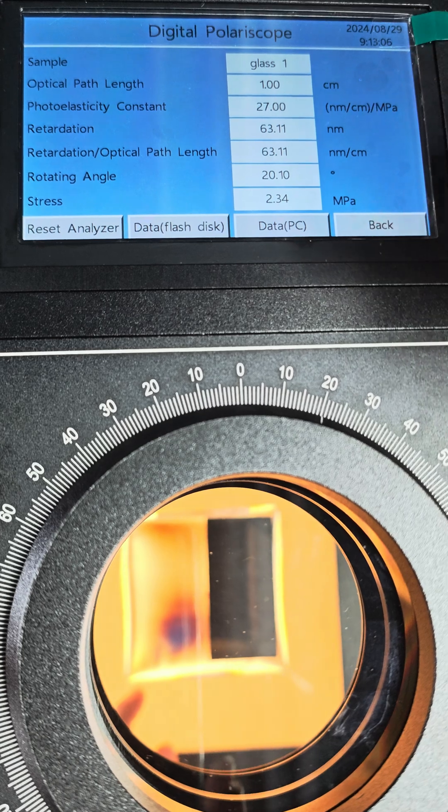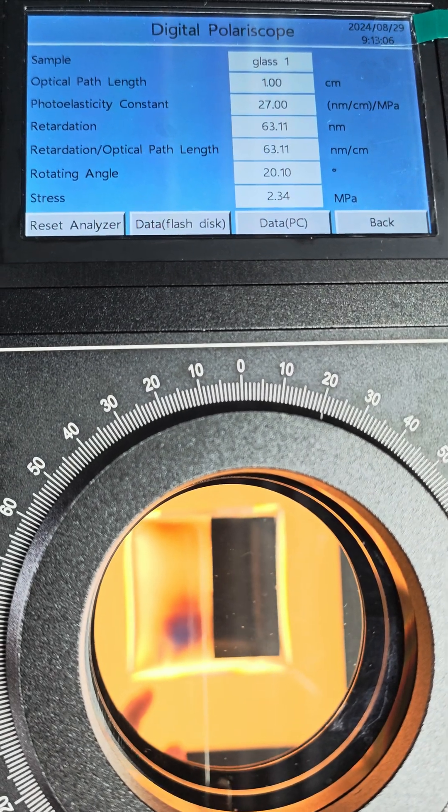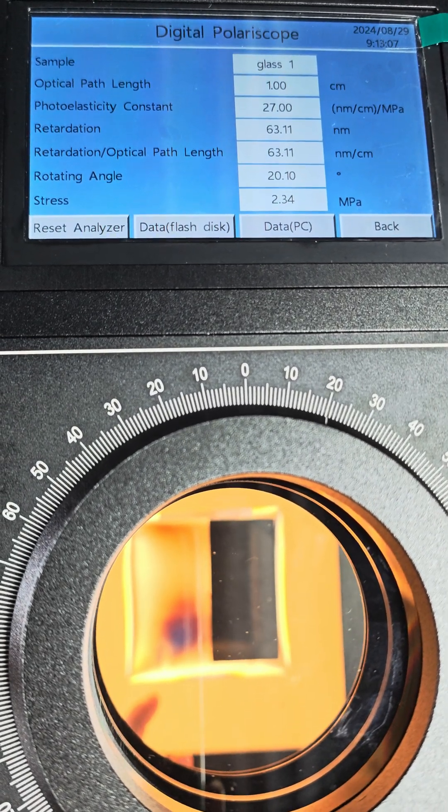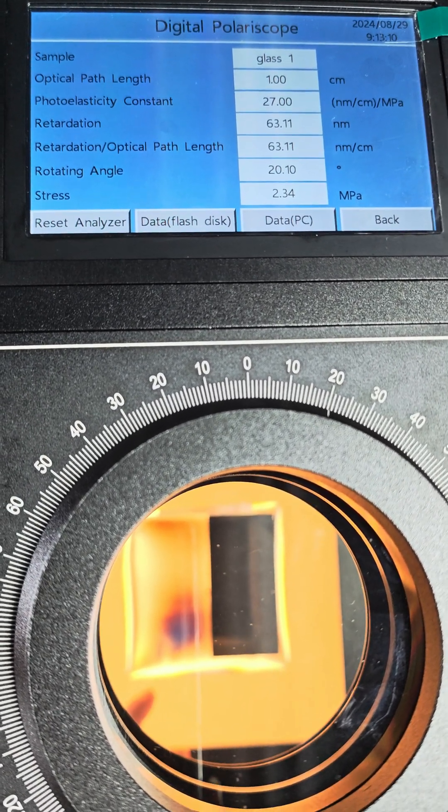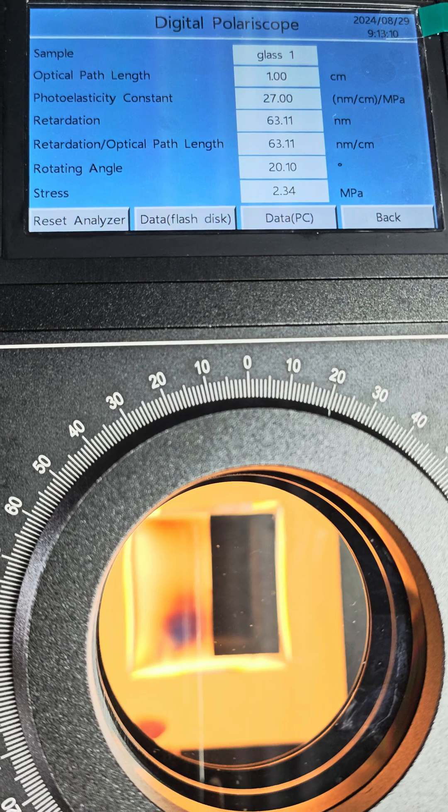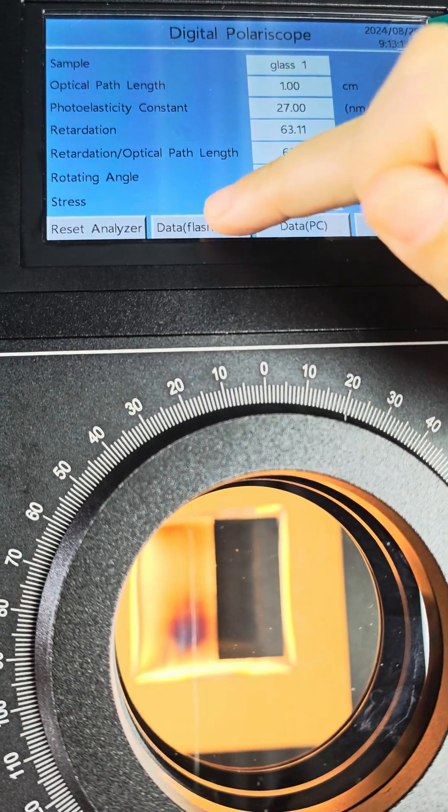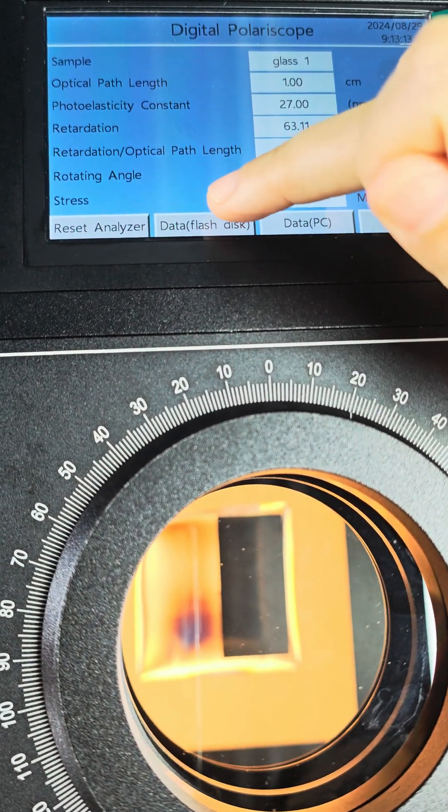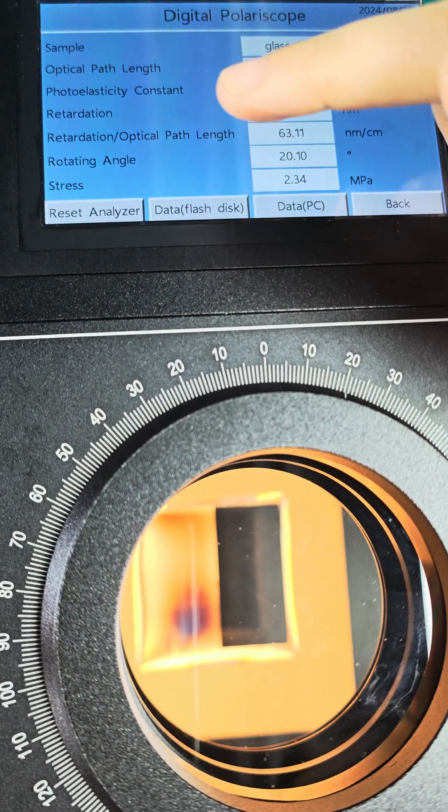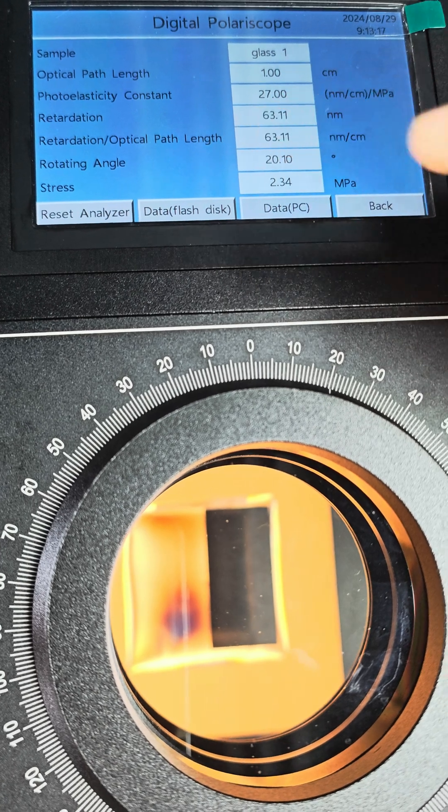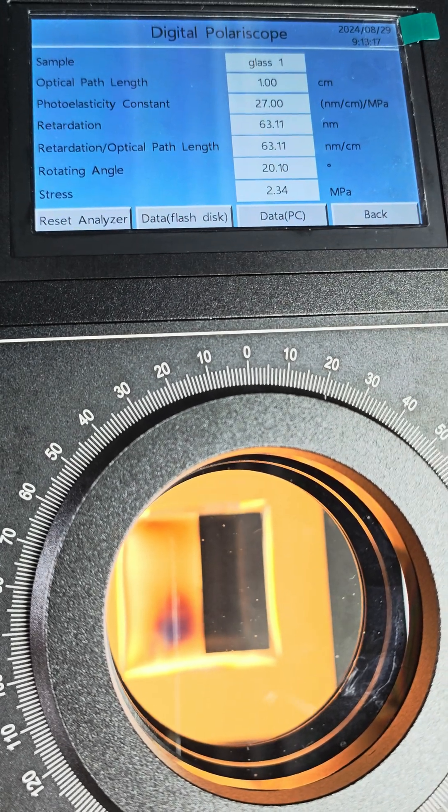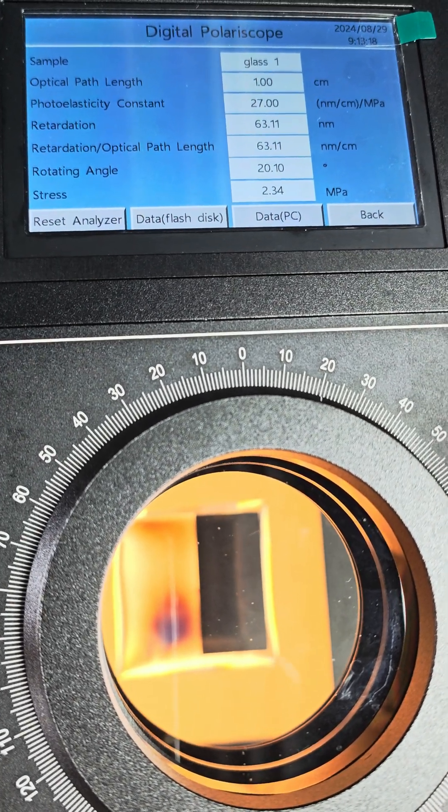If we want to save data in a flash disk, press the button data flash disk. Then the data will be stored.